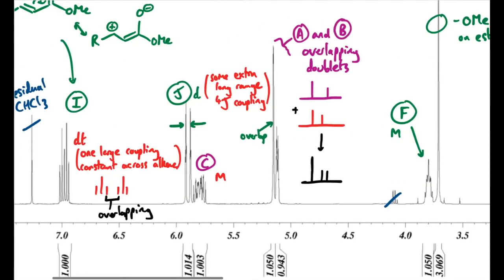So to take forwards, we'll keep these peaks on the left-hand side of the spectrum between 3.5 and 7 ppm, because they're all nicely separated. They have distinctive peak shapes, and they represent protons on either side of the stereocentre that we don't know the configuration of.